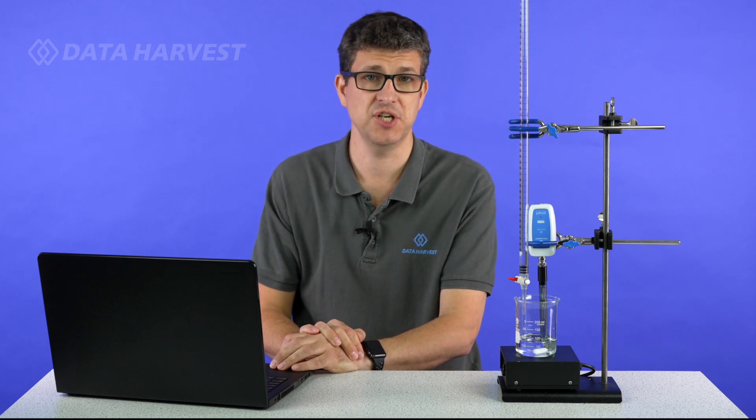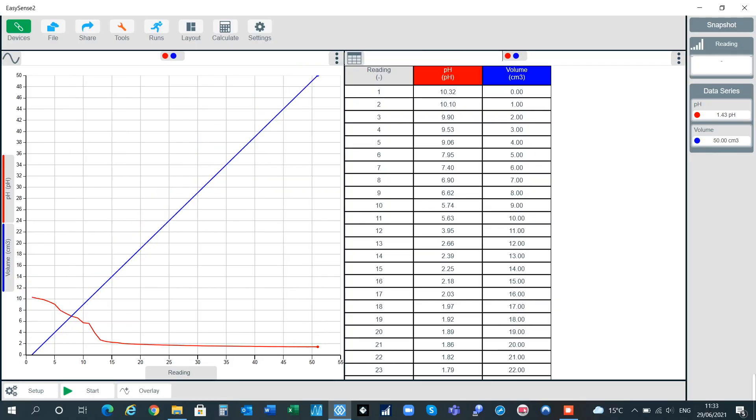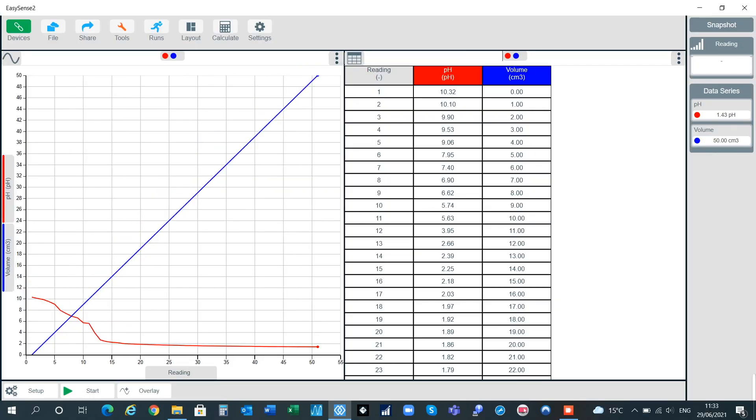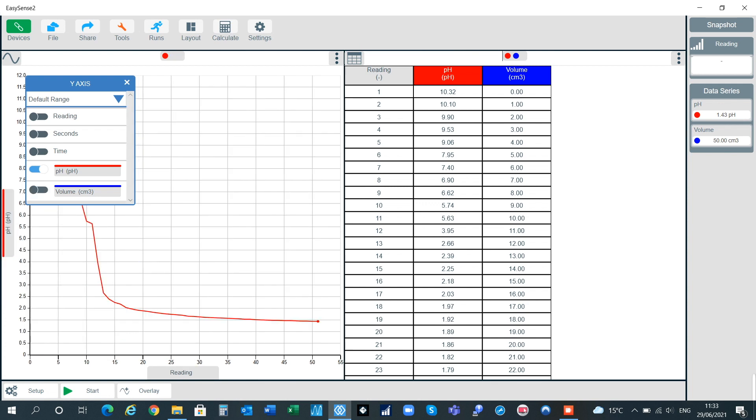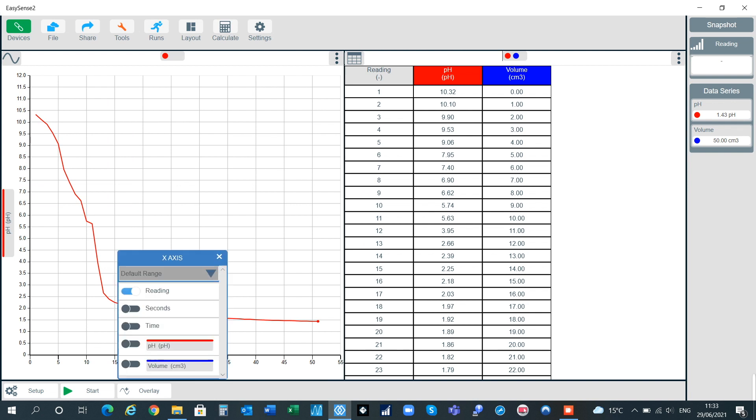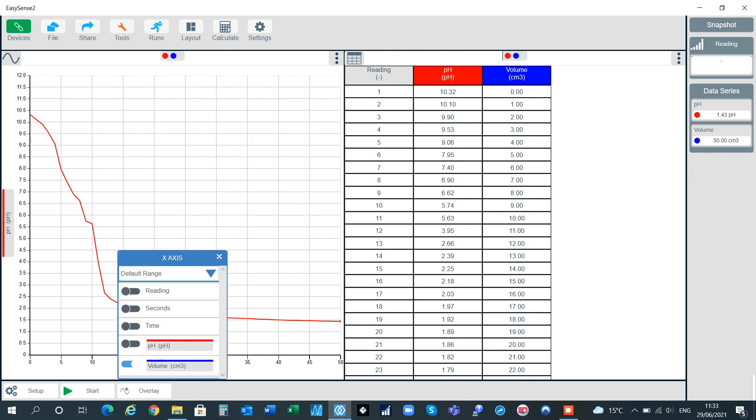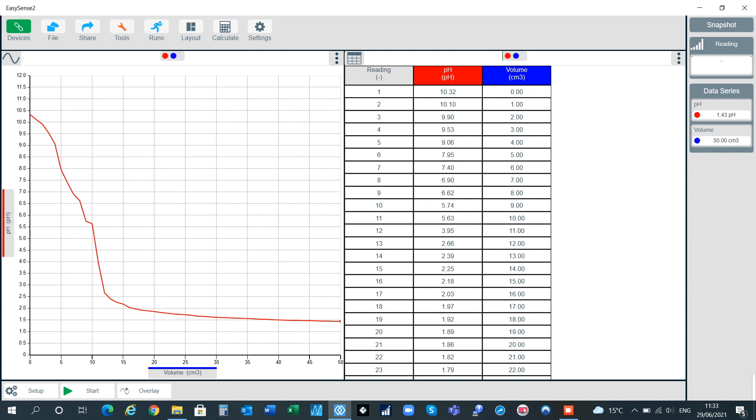So it's as simple as that to actually do the experiment. You can now play around with a graph and show what you want to show. Now the really good thing, we're going to click the stop button on here now. So we can change this to only show pH on there. And on the bottom we can show volume. So we can show pH against volume. And you want to show it that way. It's as easy as that.